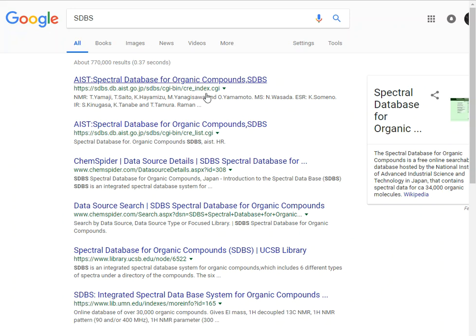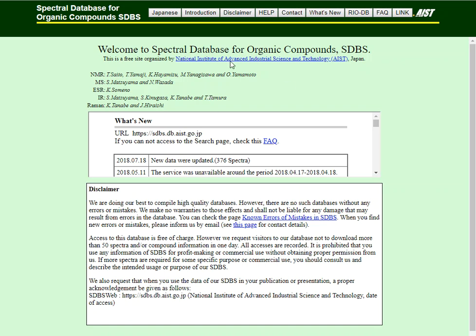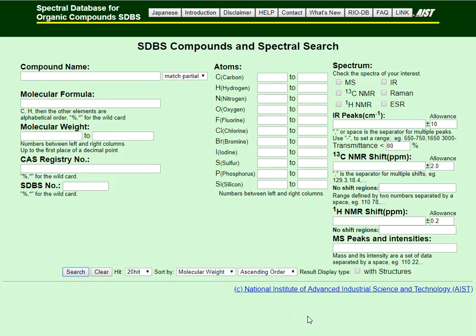When you click on this link, we use SDBS quite a bit. And the Spectral Database System, this is the website. Down here at the bottom, you're going to hit agree to the disclaimer and you're going to use the system. So this is an online database that's constantly getting added to over and over. So what does this database provide me? Well, later on in the program, you're going to be using this for a number of different reasons.